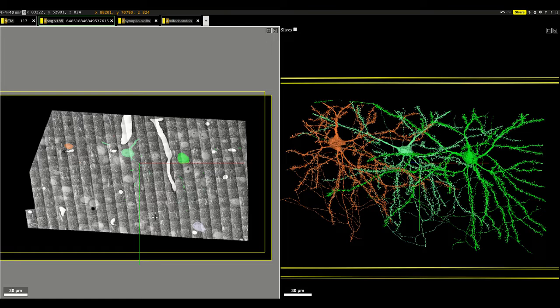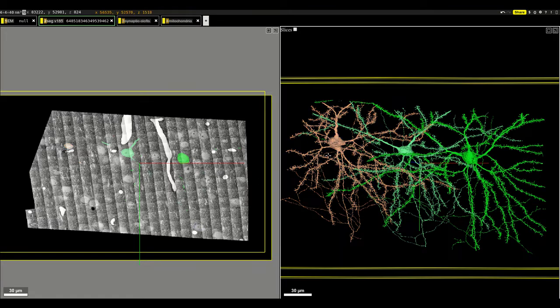After a few seconds of loading, you'll see a page like this using Neuroglancer to show the dataset. On the left side of the screen, you see a 2D view of the electron microscopy images and other dataset volumes. On the right side, you see a 3D view that uses computational meshes to display selected cells. I'll walk through some basic ways to use this interface, but if you're interested in learning more, see the question mark on the top right for more commands.